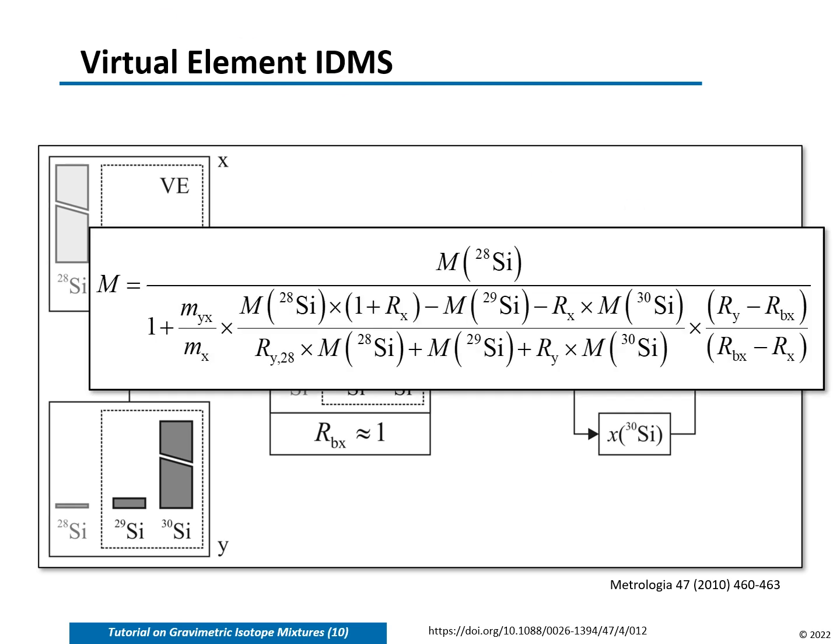The equation to calculate the molar mass combines the masses of the starting materials of the silicon isotopes and the isotope ratios in the blend with the molar masses of the isotopes. This really strange method can be applied whenever a really high enrichment and a high purity of the sample coincide.